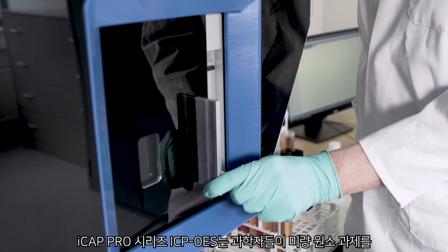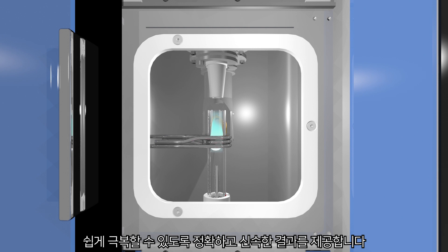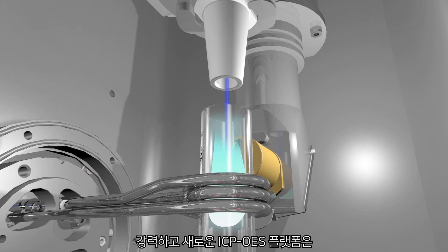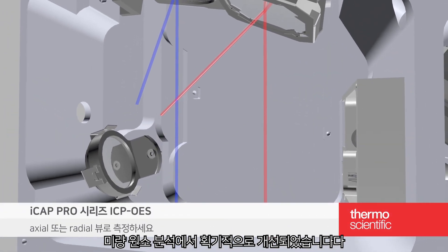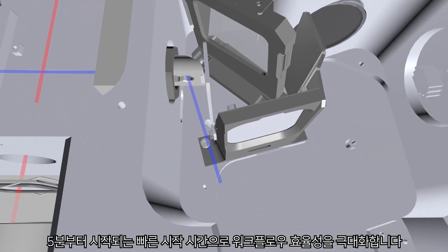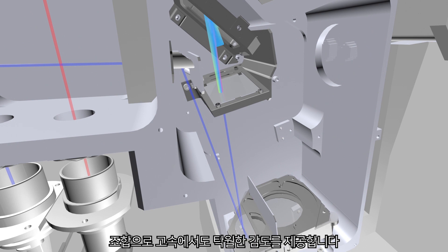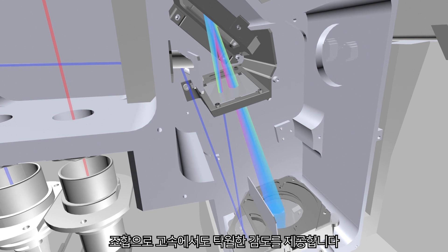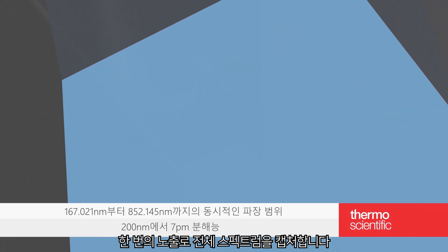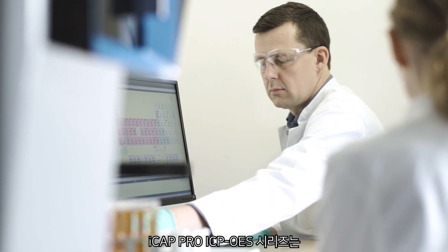The iCAP Pro Series ICP-OES enables scientists to easily overcome their trace elemental challenges to deliver accurate, high-speed results. This powerful new ICP-OES platform is a significant advancement in trace elemental analysis. A fast startup time from just five minutes ensures ultimate workflow efficiency. The unique combination of a CID detector and dual pass optics delivers uncompromised sensitivity at high speed. The intelligent full-range analysis mode captures the entire spectrum in one exposure.